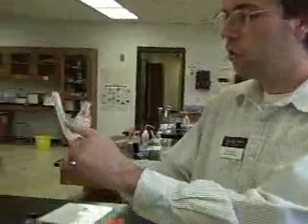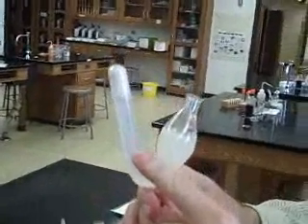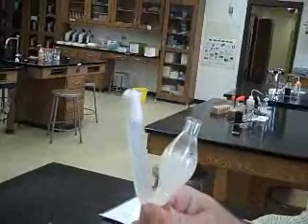So all these yeast cells here were underwater, so they didn't get much oxygen. Because they couldn't get oxygen, they didn't do aerobic cellular respiration. So they switched over and started doing alcoholic fermentation.